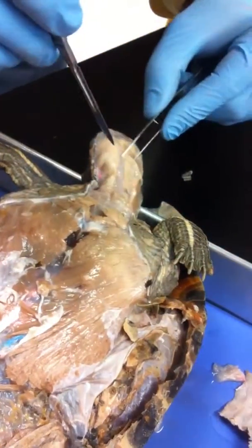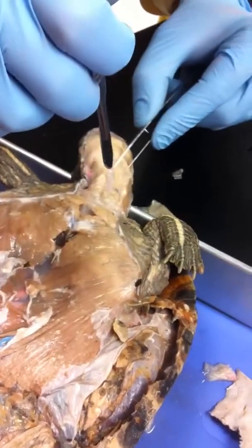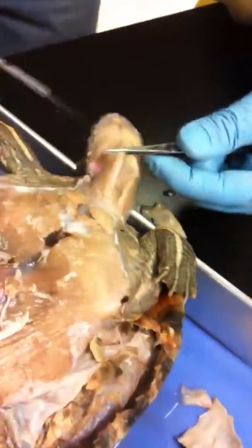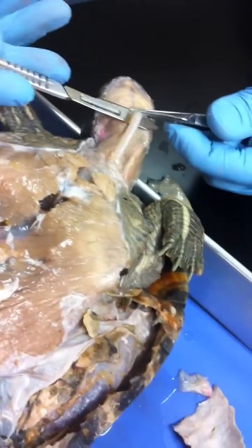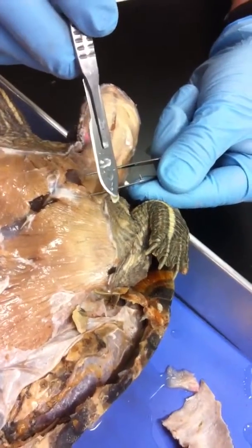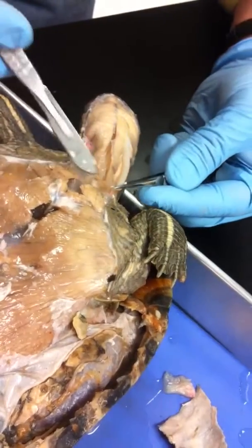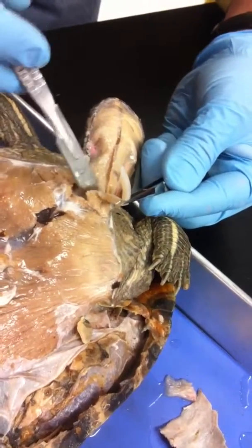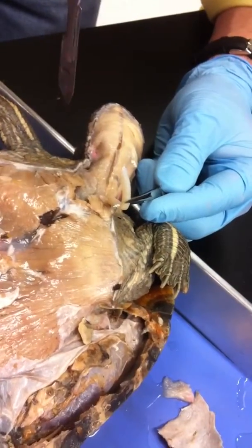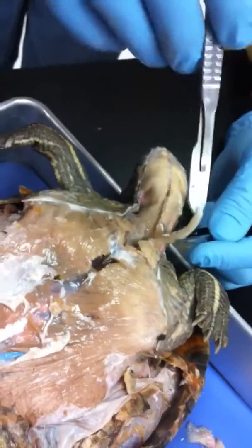I'm going to go next to the trachea and sever it. So there's your opening into the air. If you're careful later on you can dissect out the entire lung set, or at least get it all visible, and if you wanted to you can blow on that.